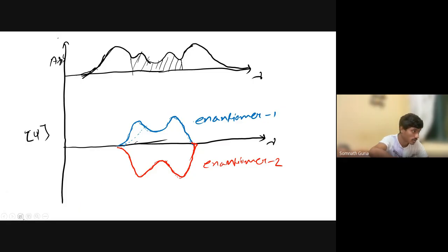So this is the color blue. So it may be possible of that. This is another one. It may be possible. This transition may be, this one also maybe looks like this one. It may be possible depending on which transition actually shows that kind of CD activity. Okay, positive ellipticity or negative ellipticity.